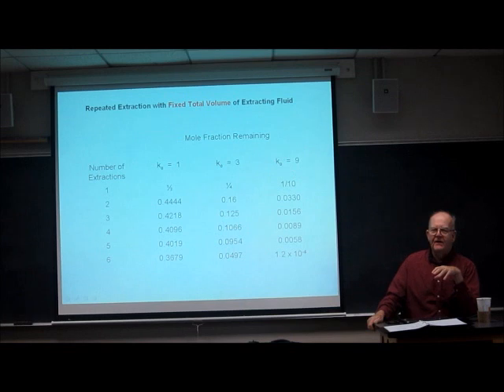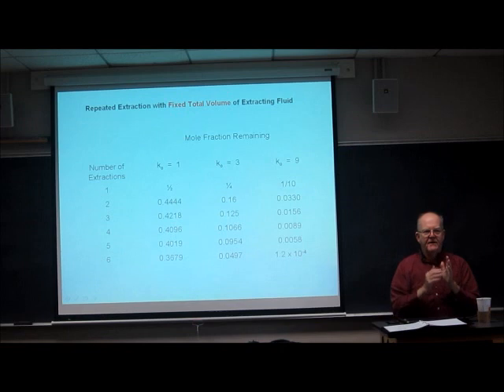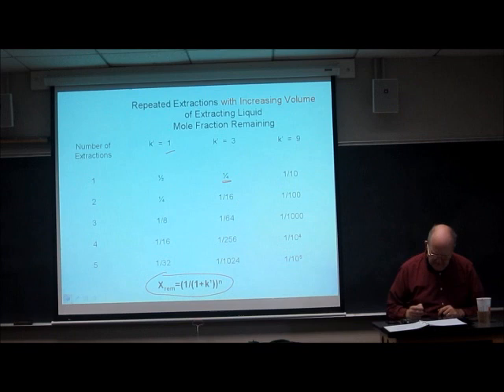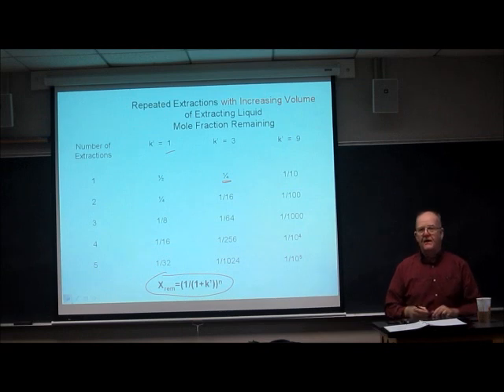Is there another way to do the extraction? Yes, there is, because otherwise I wouldn't ask the question. In the repeated extractions, what I did is I kept adding more volume and more volume and more volume. So my total volume back here is 100 mLs, 200 mLs, 300 mLs, 400 mLs, 500 mLs.